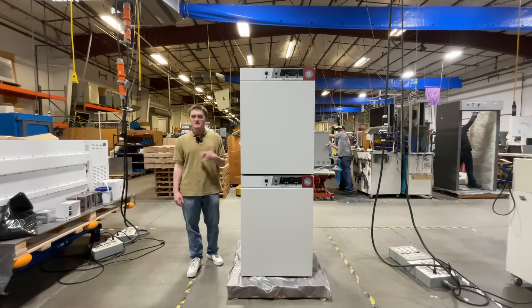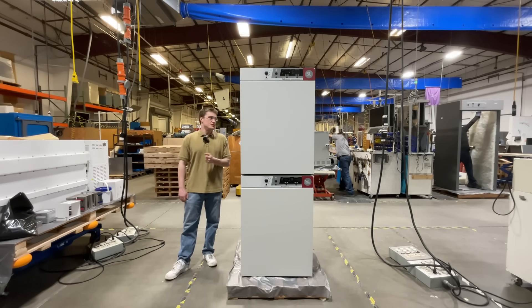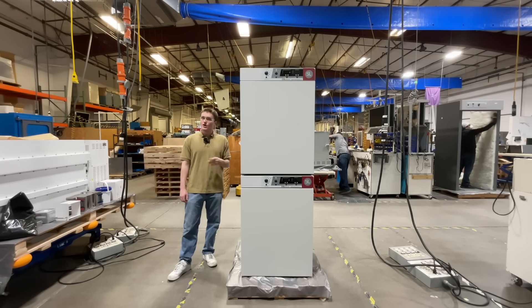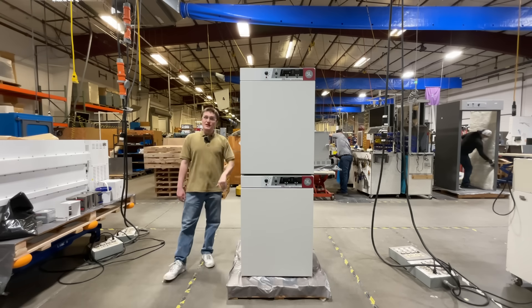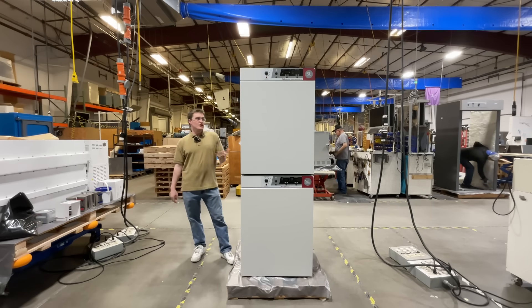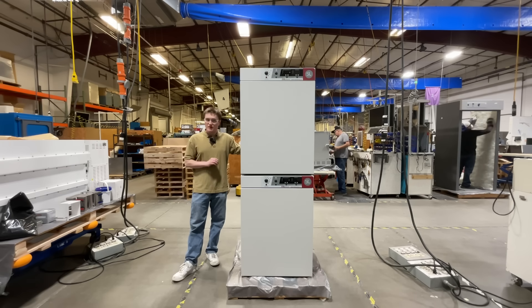Hello, my name is Kord Sanksteak. I'm a design engineer here at Sheldon Manufacturing, and today I'm going to be introducing the Shell Lab SCO-10A CO2 Incubator. In this video, we're going to cover everything you need to know to get the best results from this advanced incubator designed for optimal cell culture environments.